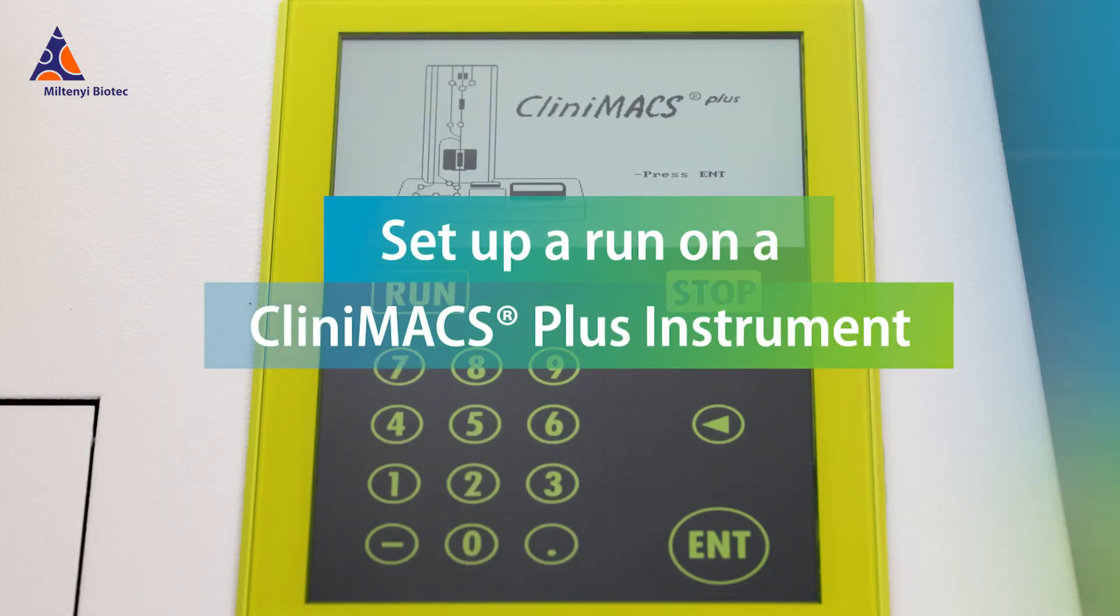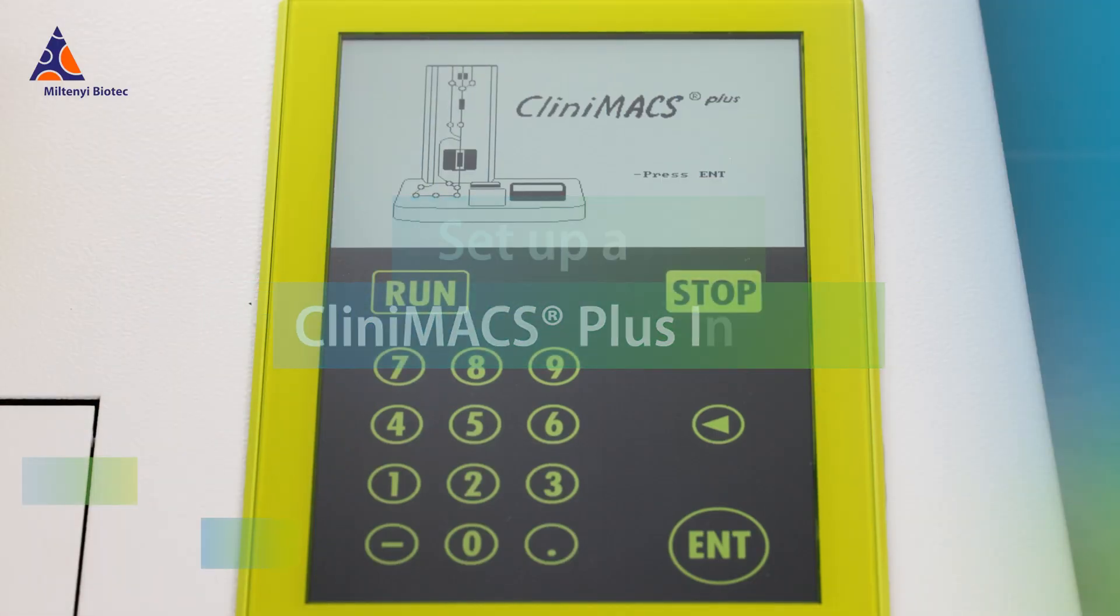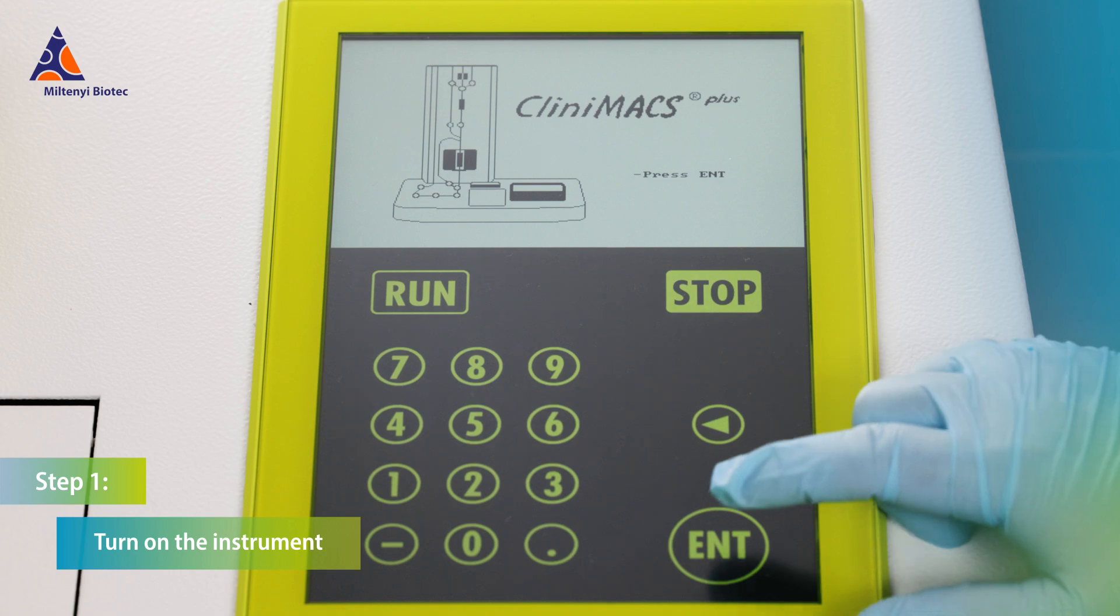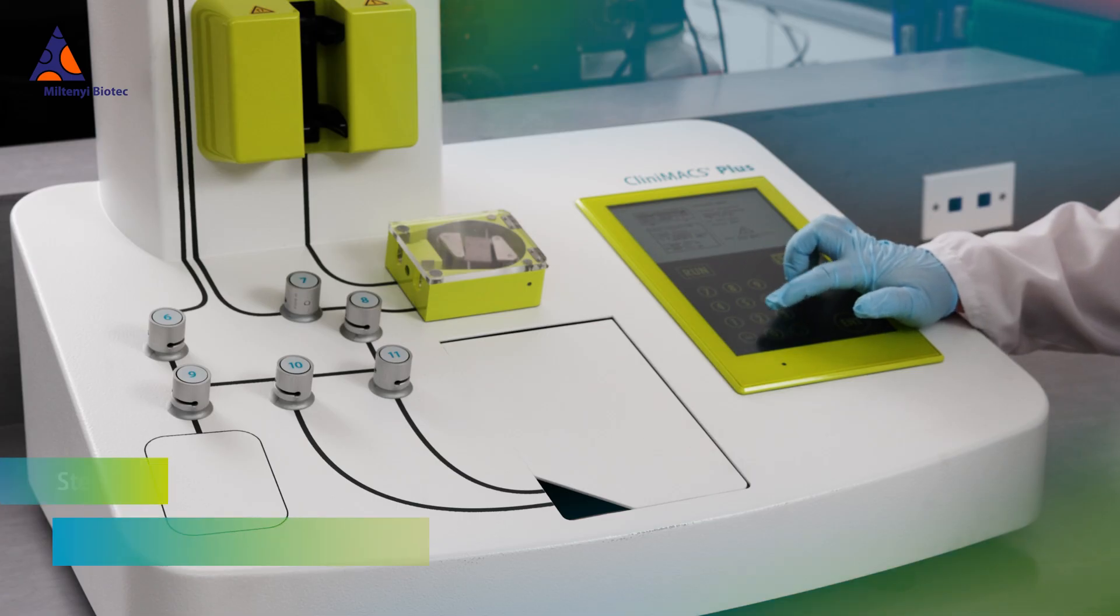This is how you set up a run on the Clinimax Plus instrument. Choose the appropriate enrichment or depletion program. Enter the parameters for your starting material.